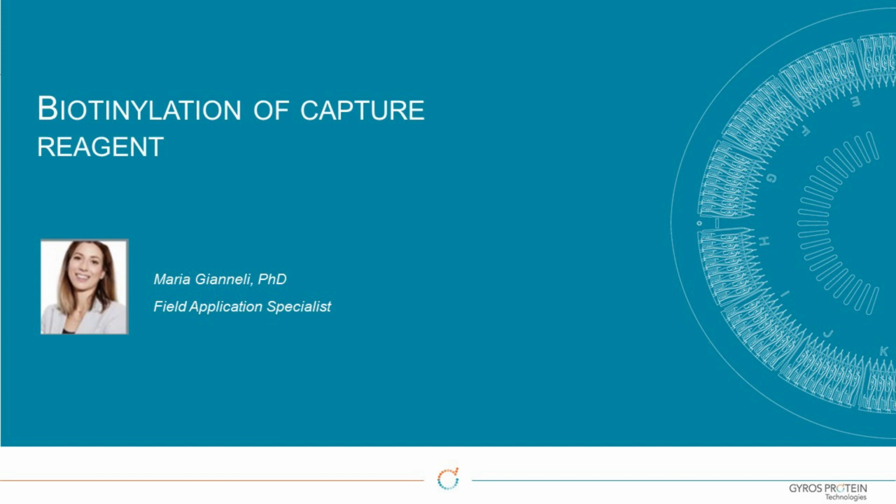My name is Maria Gianelli and I'm a field application specialist at Gyros Protein Technologies. In this video, we will cover the procedure of biotinylation of the capture reagent.